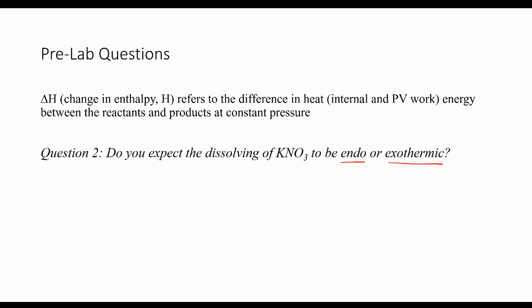And one of the things you can look at would be to read the section from chapter 13 that was outlined earlier on temperature effects and solubility. So this is kind of the overarching idea. Temperature effects. How does temperature affect the solubility of an ionic compound?